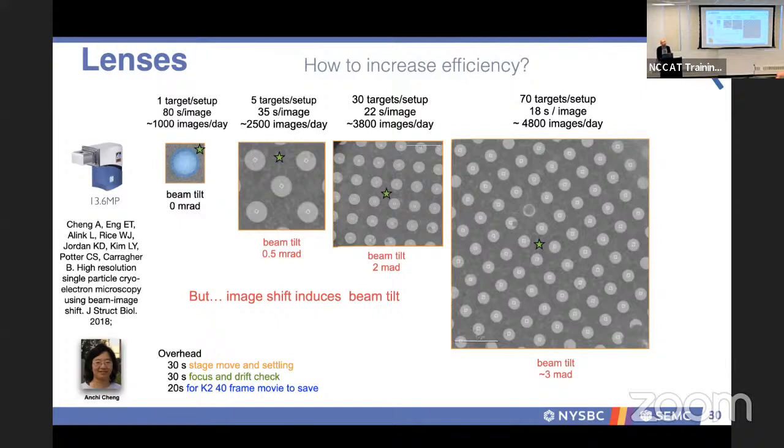And you might notice when you're doing data collection, even if you set a static defocus, when you start to image shift, especially extended image shift, you'll have a distribution within your defocus. That being said, there's also a situation where most grids are not flat. Even if you have a flat grid, it's typically on some angle, anywhere from 1 up to 7 degrees. So that's another contribution to that.